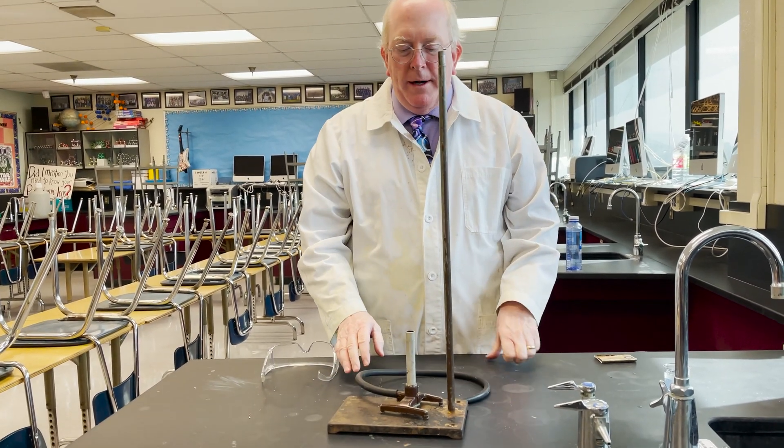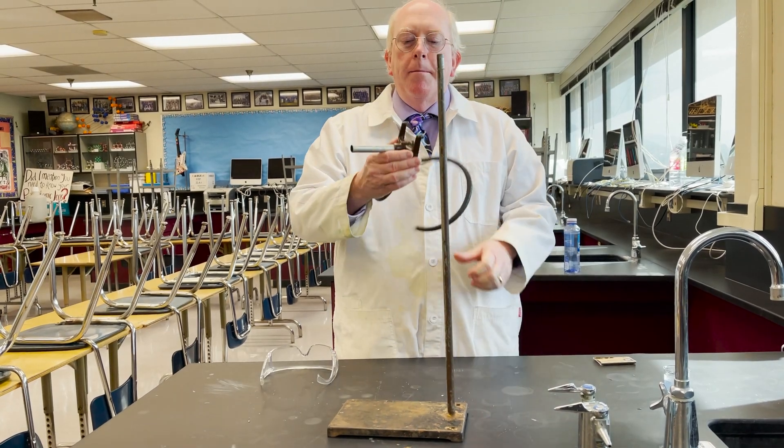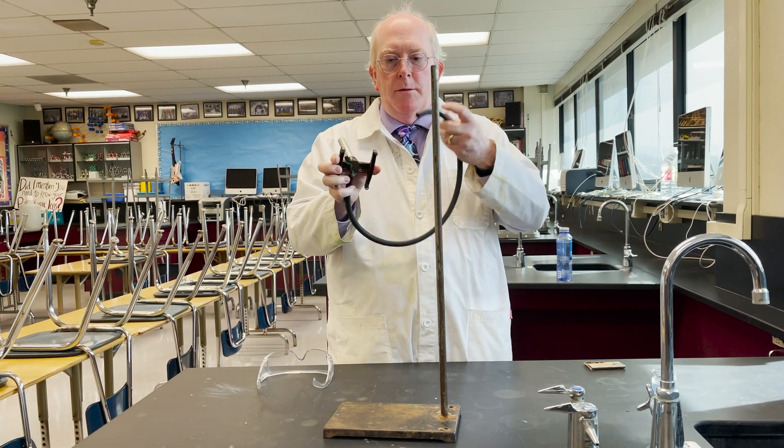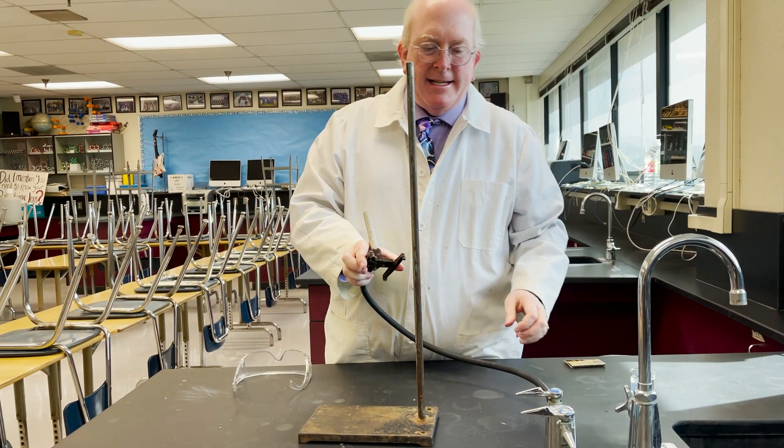Typically what we do is we take out a ring stand and we just use that as the base for the Bunsen burner. The Bunsen burner itself will be hooked up to a rubber hose. We'll connect that rubber hose to the gas line.